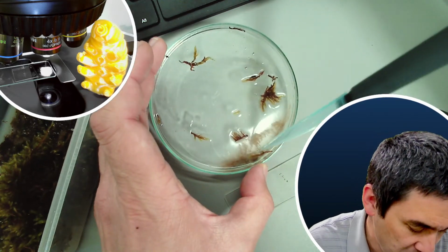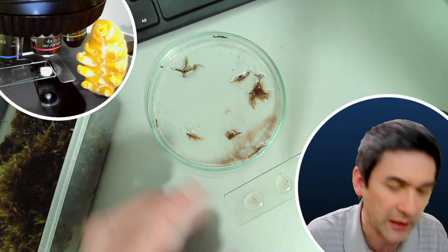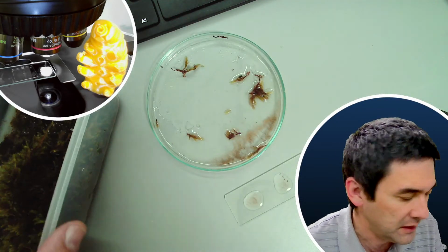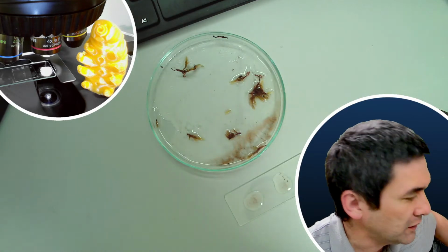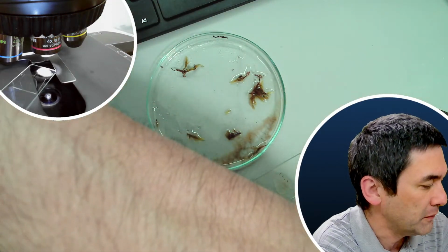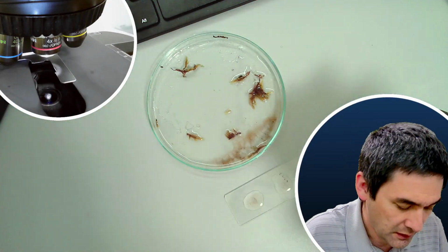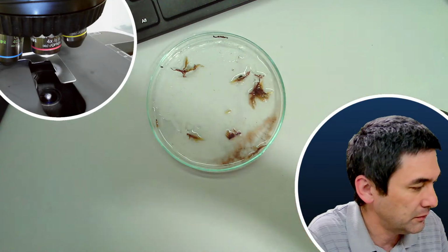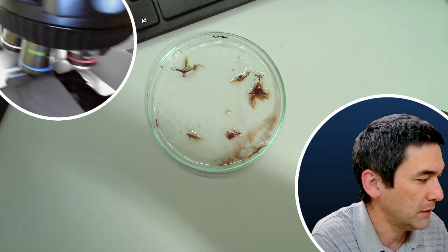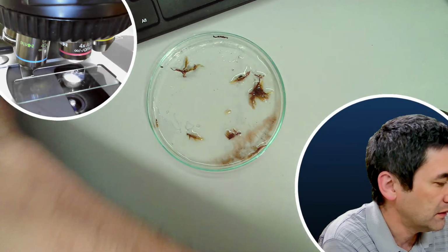And as a first quick look, I don't even put a cover glass on top yet. I simply observe this under low magnification, to get an overview of what's present at all. Okay, so let me do that. Here again is the microscope, and let's have a look.